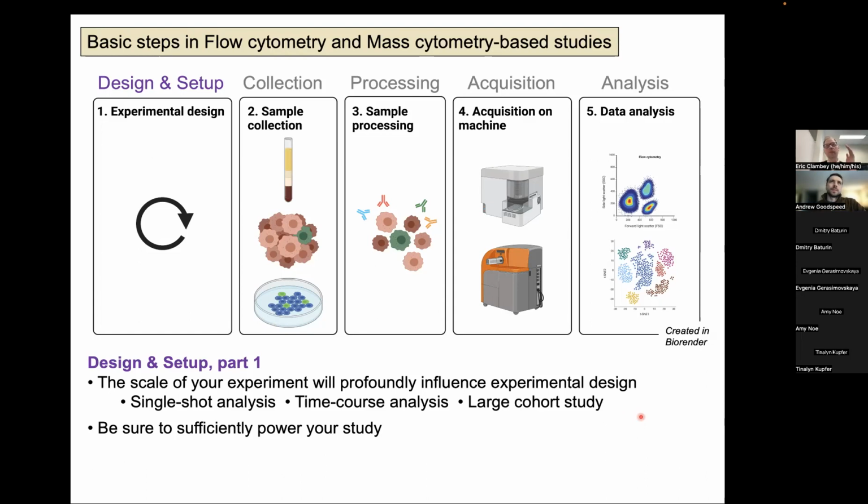For example, that experiment was done on Monday, that experiment's done on Thursday. Oh, and actually the major variation between them is simply because there are some experimental variables that differ between Monday and Thursday.